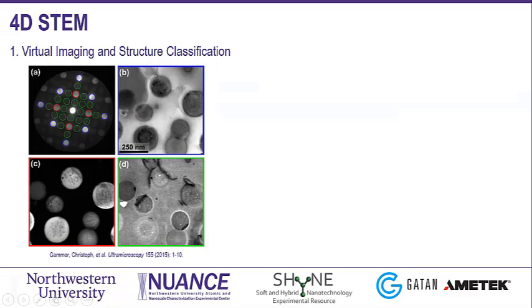For example, B here is an image that was formed by integrating only this spot over here. The left corresponds to the red, and D corresponds to the green spots here, which are the dim ones.